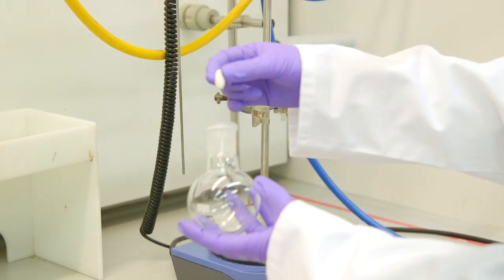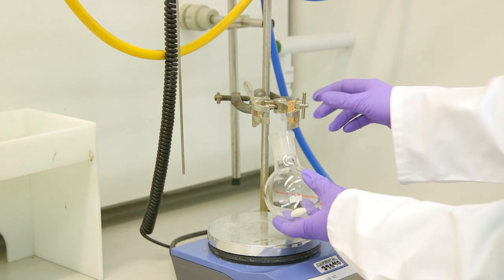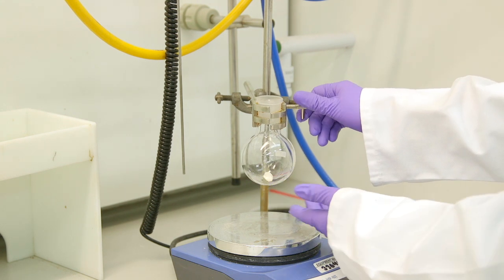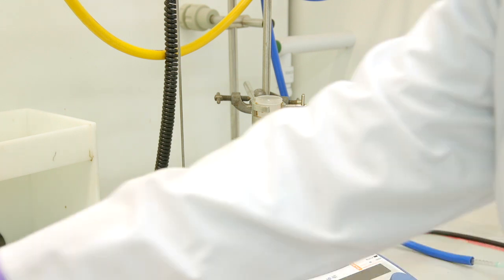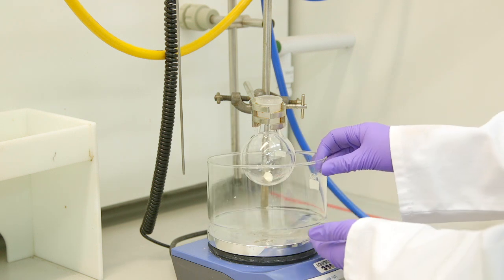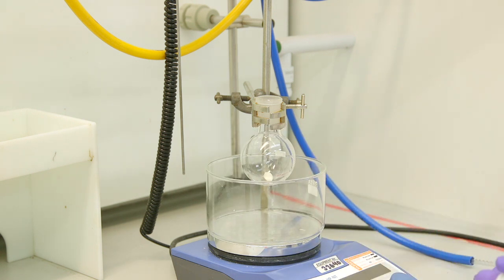First we are going to take our round bottom flask with a magnetic stirrer bar and clamp it in place. Underneath the flask we will place our secondary container. Should there be a leak from the flask, the secondary container will capture the lost material.